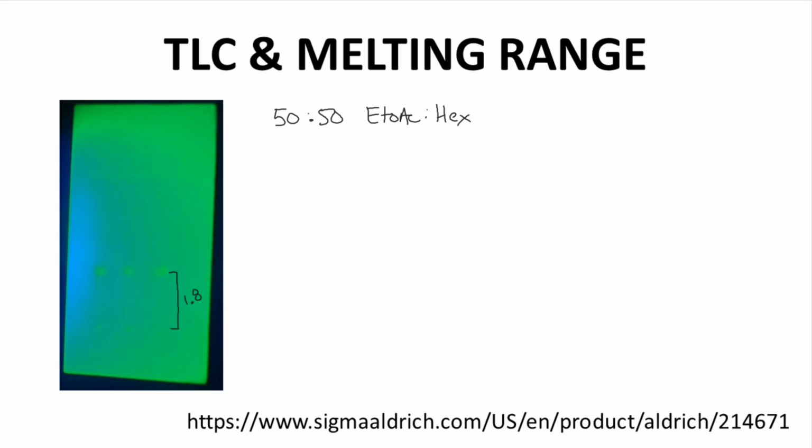The solvent front traveled 4.5 centimeters. That corresponds to an Rf value of 0.40. This TLC ostensibly looks like one spot, but the lighting is making the image overexposed.